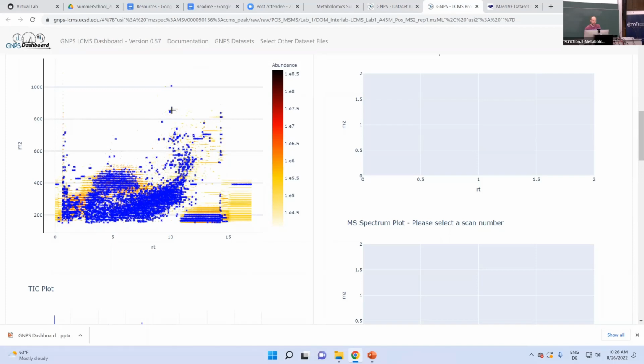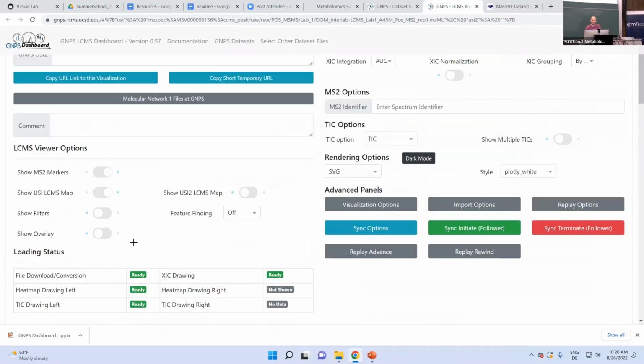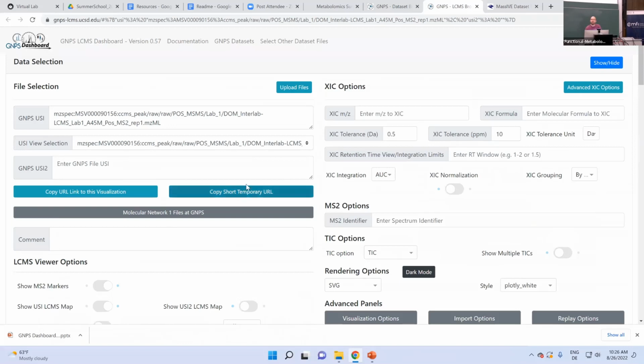And then, let's actually explore this a little and let's verify some of the compounds that we found. So who can tell me the m/z value of one of the molecules that you would be interested in? From your analysis so far. Wait, how about 3 or 4.1 something? I don't remember. What is it? 1, 2. First thing is on my screen in the series. Okay. It has a structure.